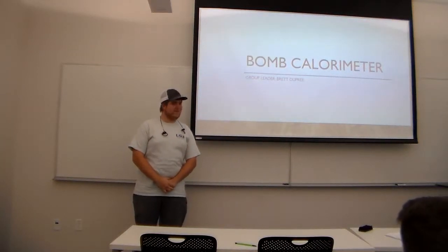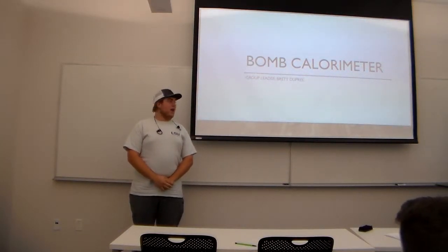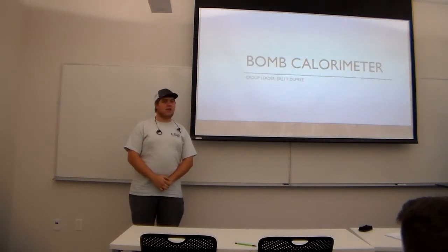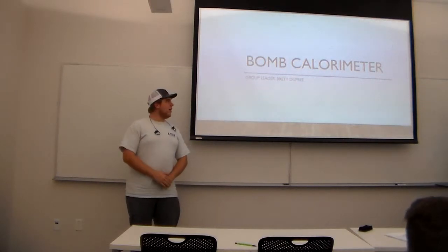Experiment. Hey guys, I'm Brett, and I'll be talking about the bomb calorimeter. Now I know this will be the 6th time you've seen a similar presentation, so I'm going to try to make it a little interesting.